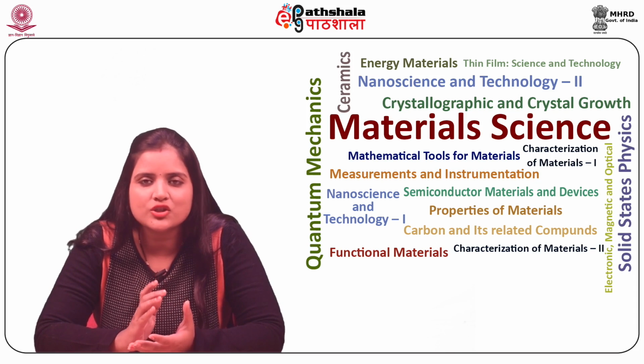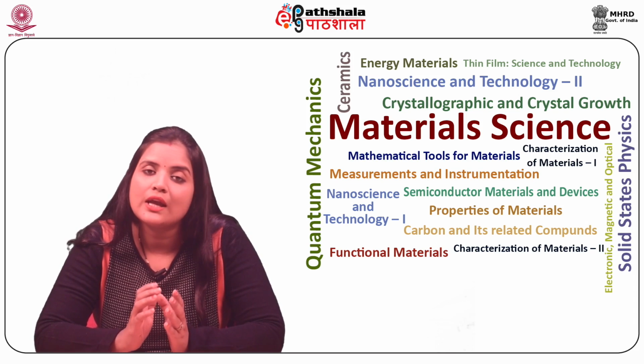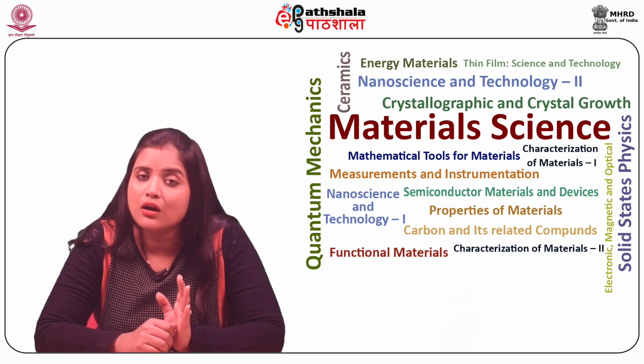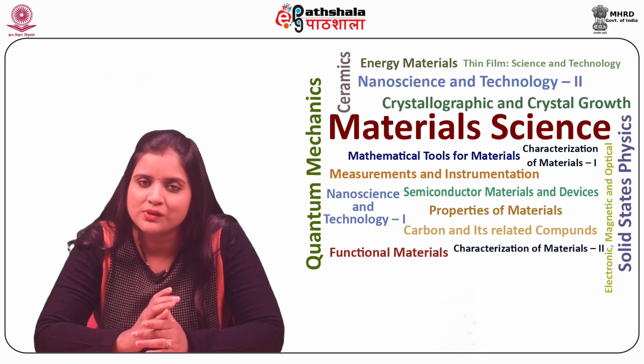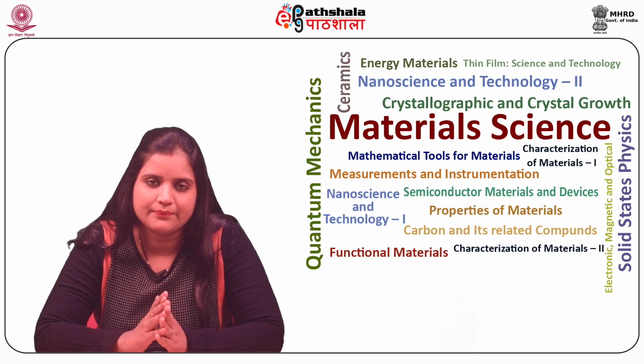While the first digital processing of the hologram was performed in 1967, it was not until the early 2000s that digital holographic microscopy started to supersede film-based techniques.